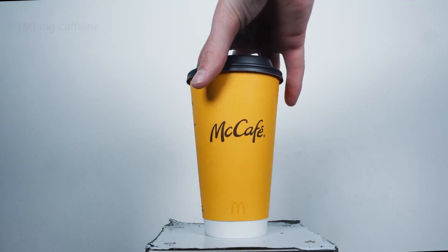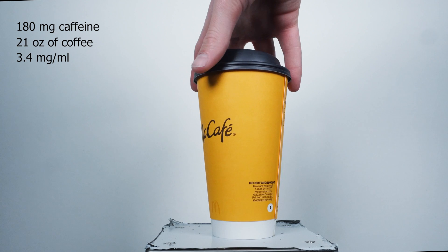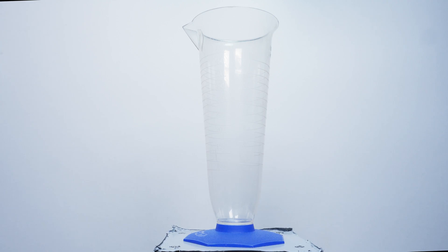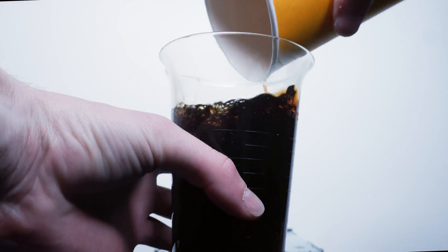The first company I'm going after is McDonald's, which boasts it has about 180 milligrams of caffeine within its 21 ounces of coffee. The first thing I need to do is go to McDonald's and get a coffee, so that's exactly what I did. Once we had the coffee I poured all of it into a container so I could see what I was working with.